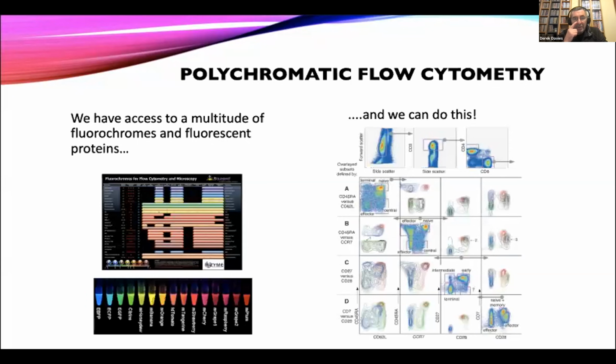And we know, don't we, that flow cytometry has changed quite rapidly in the last 15 or 20 years. We've seen the introduction of many different types of laser. We cover now the whole range from deep UV 325 up to infrared or near infrared lasers. We have many more fluorescent probes than we had 20 years ago, many more fluorescent proteins, which means that we can do very clever things like 16, 17 or more analytes in an individual experiment.